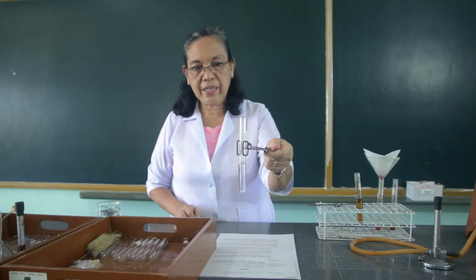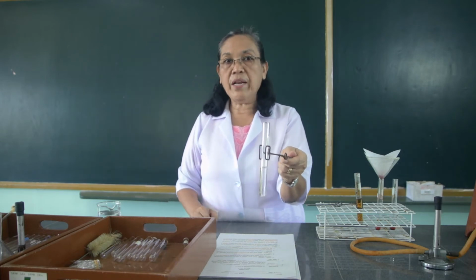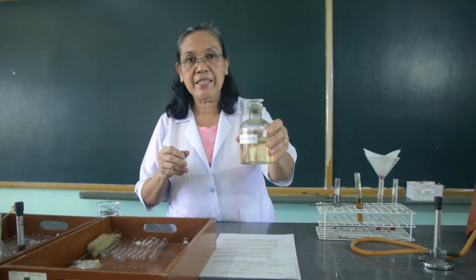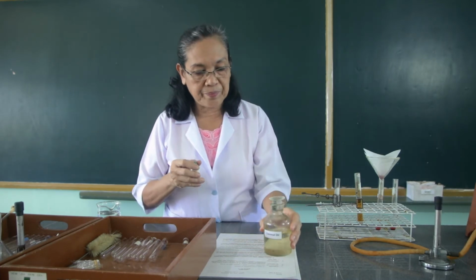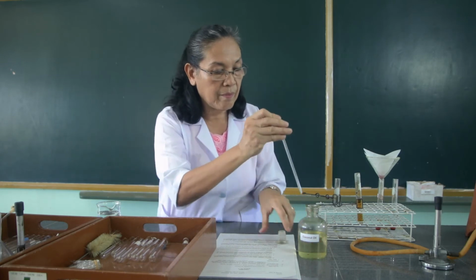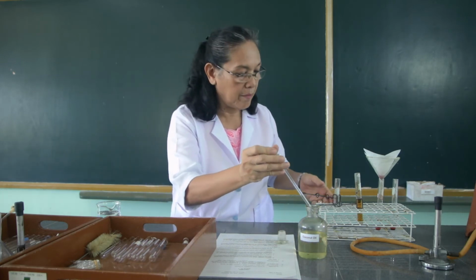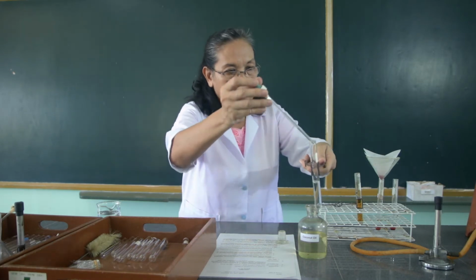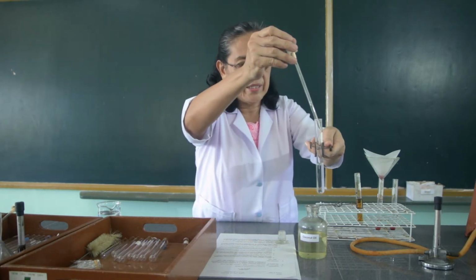Let's add into this distilled water 1 ml of the coconut oil. This is the coconut oil. Then let's add 1 ml to the distilled water.